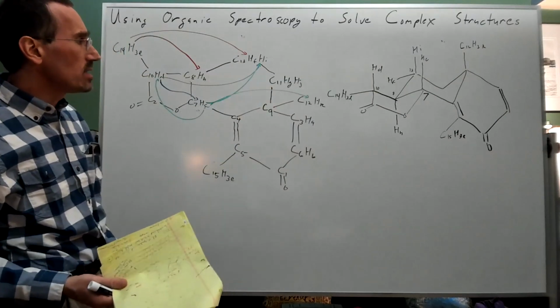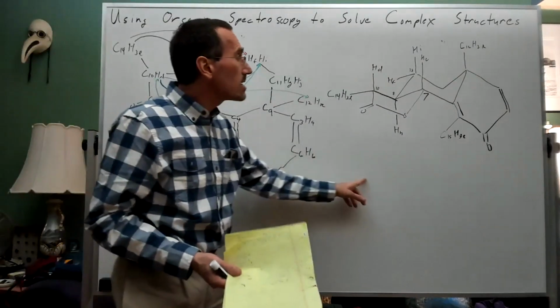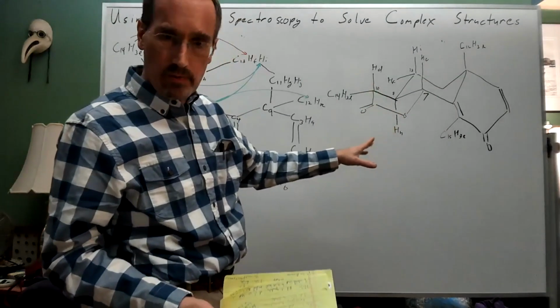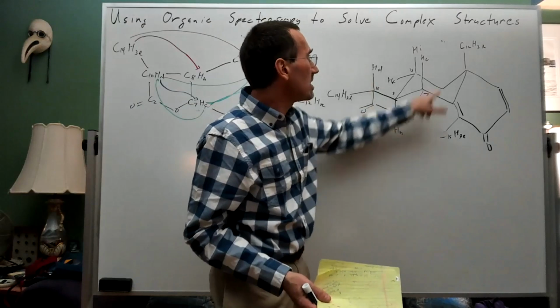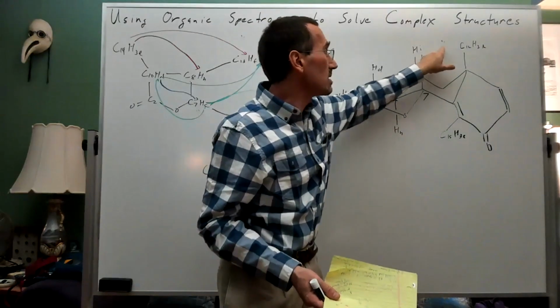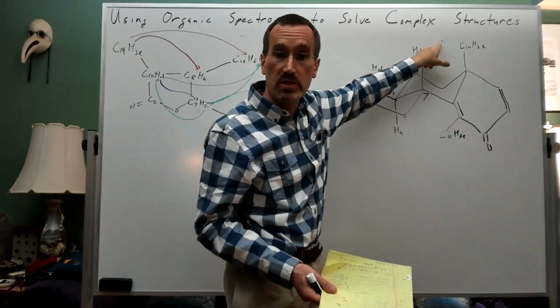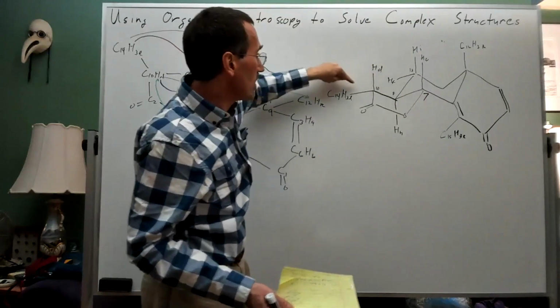You could imagine additional experiments that we might want to do. I think the next thing I would do if I wanted to was make a model in PyMol, clean up the structure, check out for short distances. Now, all of these distances here are going to be about 2.5 angstroms. So these are going to be screaming NOEs. Ditto for this distance here.